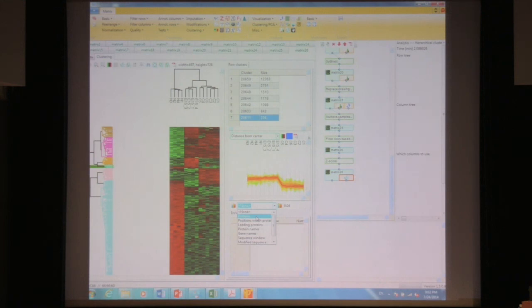So in the case that we had 1,000 phosphosites on a single protein, we don't want to count that as being significant just because there were 1,000 sites. So by selecting proteins in here, we account for that. So we only count each protein once then. Right? And then you would press this show enrichment box here, which I'm not going to do because it takes minutes. And you would see the enriched categories from all of the categorical columns in this box down here.